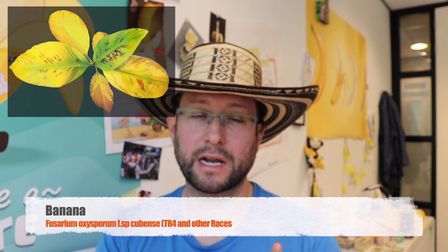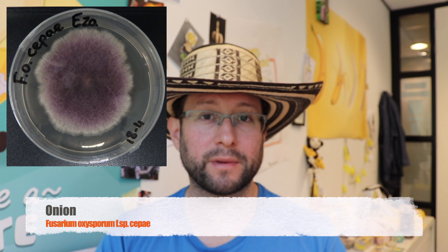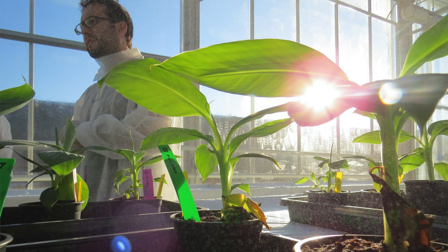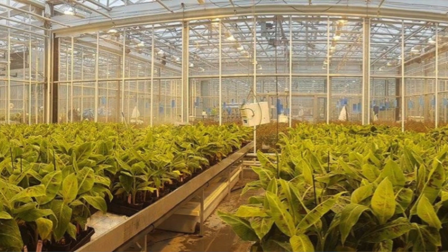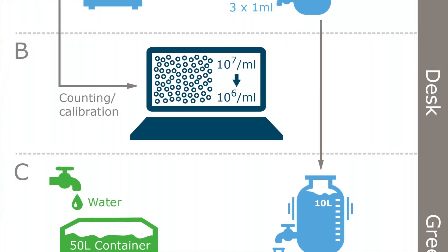The methods in this paper were standardized for banana but they have the potential to be transferred to other pathosystems. In this article I also tested different Fusarium species, different forma specialis, and even different VCGs, and it works very well. The paper, which you can find in the information box, is the compilation of all the protocols I used and standardized during my PhD at Wageningen University. It includes production of spores, inoculation methods, and interpretation of results, which we call phenotyping.